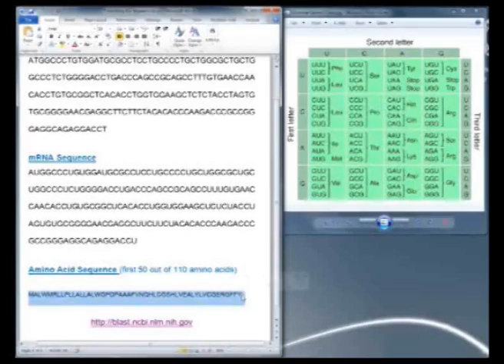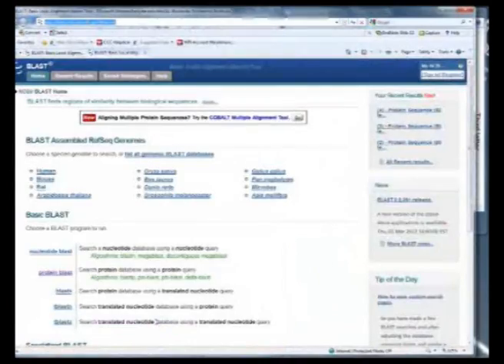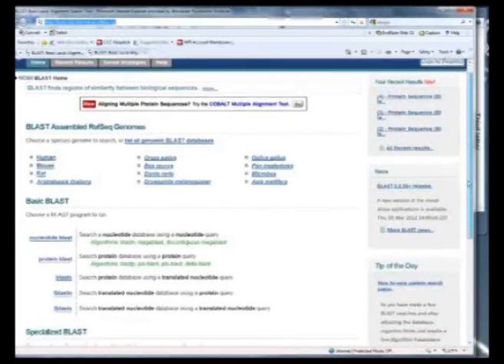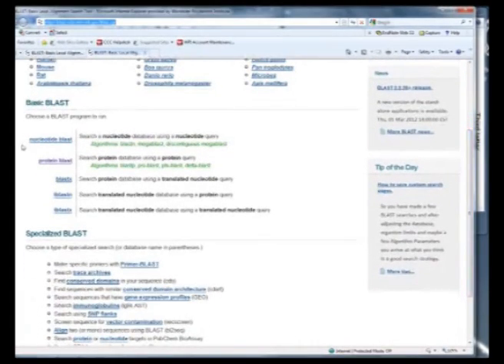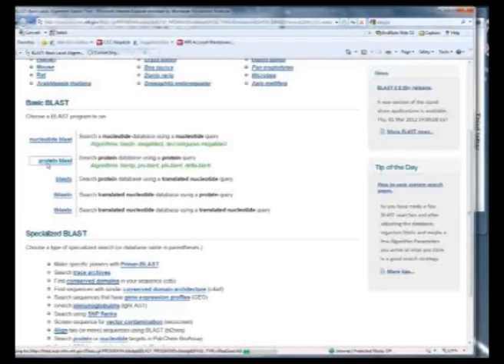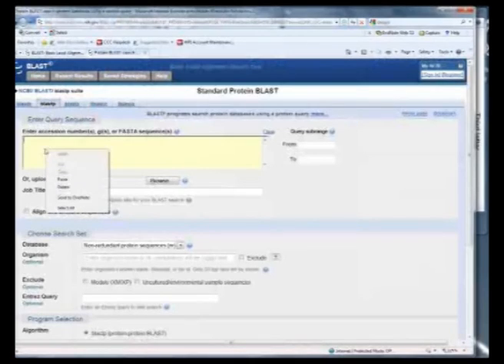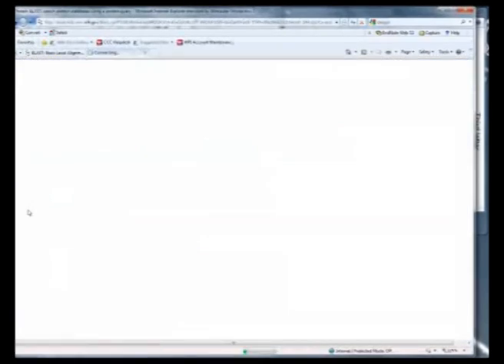Copy the amino acid sequence and go to the website blast.ncbi.nlm.nih.gov, which is a site provided by the National Institute of Health. On this website, we can search within a particular species or choose a specific computational program based on whether we have a protein or nucleotide sequence. We will choose protein BLAST because we are looking for a specific protein based on the amino acid sequence. Paste the sequence where it asks for the accession number or FASTA sequence. Notice that you also have the options to upload a file, name your BLAST search, or enter more than one sequence in order to align them with each other. For this example, we will only use one sequence.